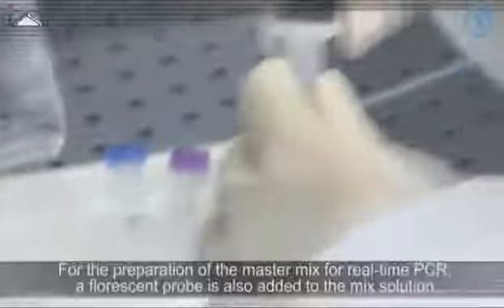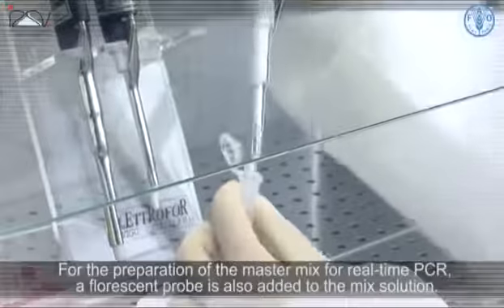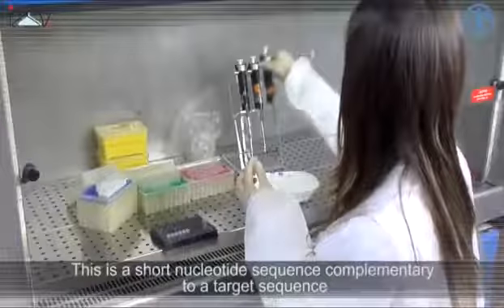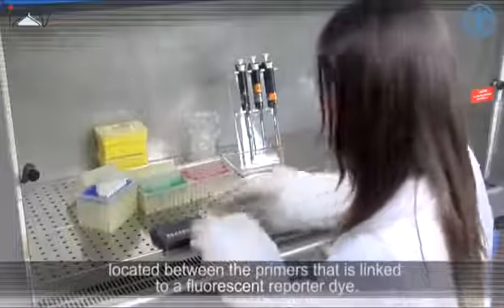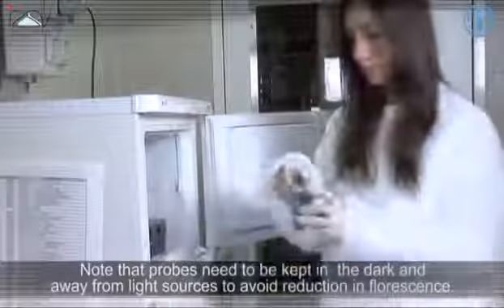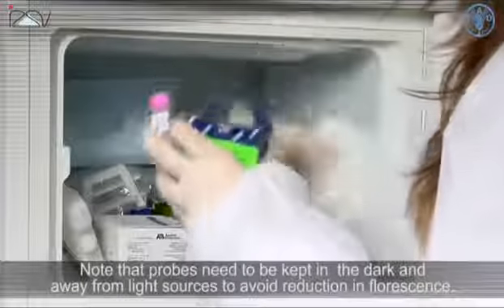For the preparation of a master mix for real-time PCR, a fluorescent probe is also added to the mix solution. This is a short nucleotide sequence complementary to a target sequence located between the primers, that is linked to a fluorescent reporter dye. Note that probes need to be kept in the dark and away from light sources to avoid reduction in fluorescence.